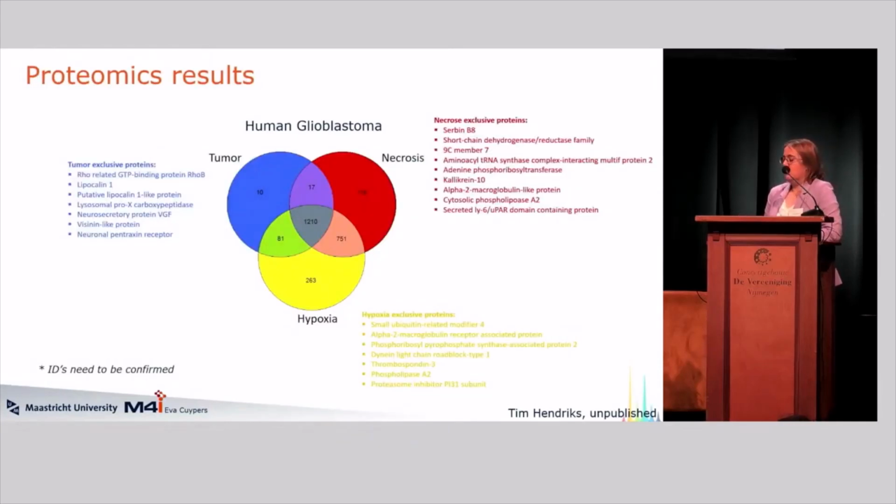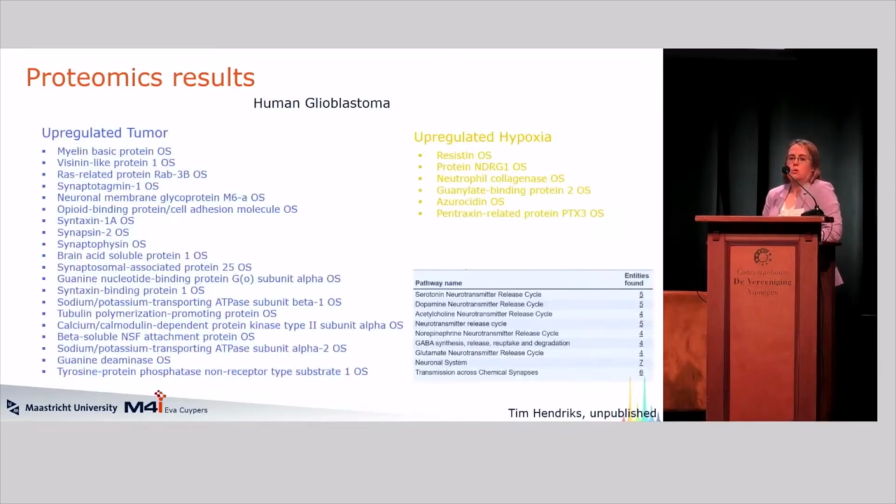These are very new results, so they still need to be confirmed, but based on this workflow, even though we did MSI before on the same sample, we can still find very interesting proteins and protein pathways that are upregulated in the tumor. So this is, at the moment, the most information we can get out of one single tumor section, and let's see where we can head within a few years.